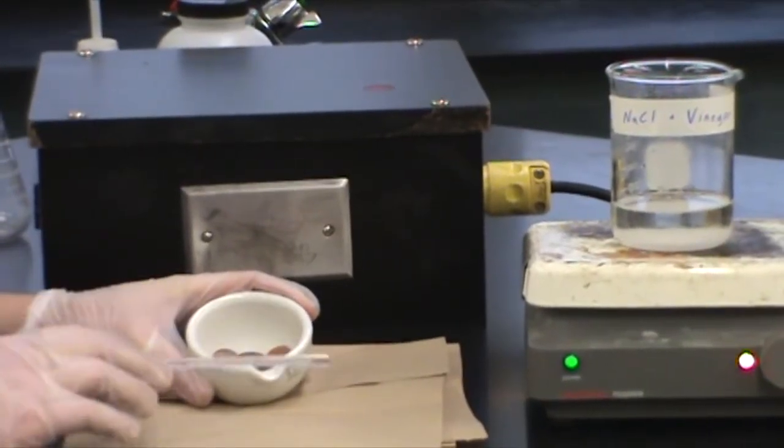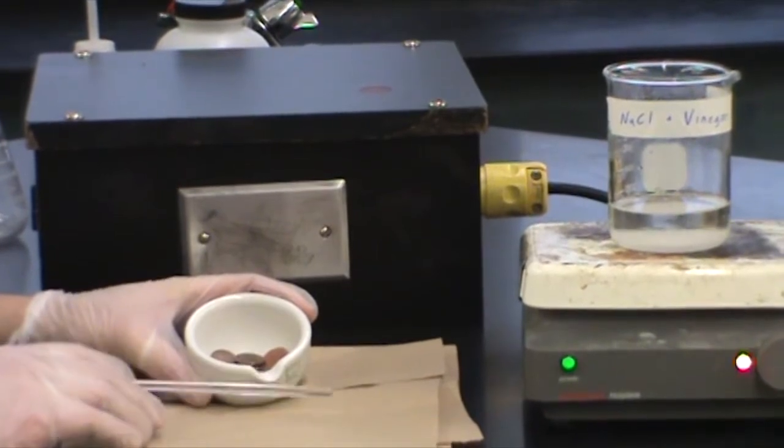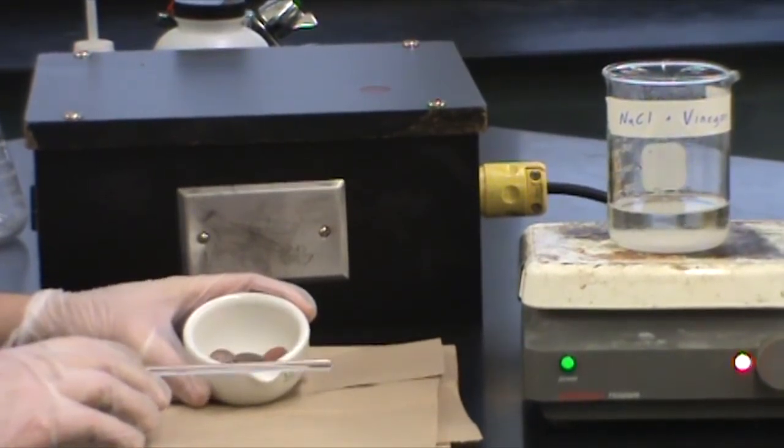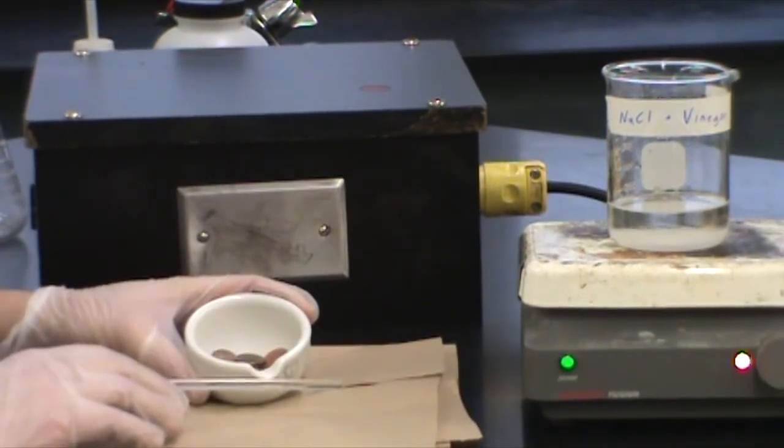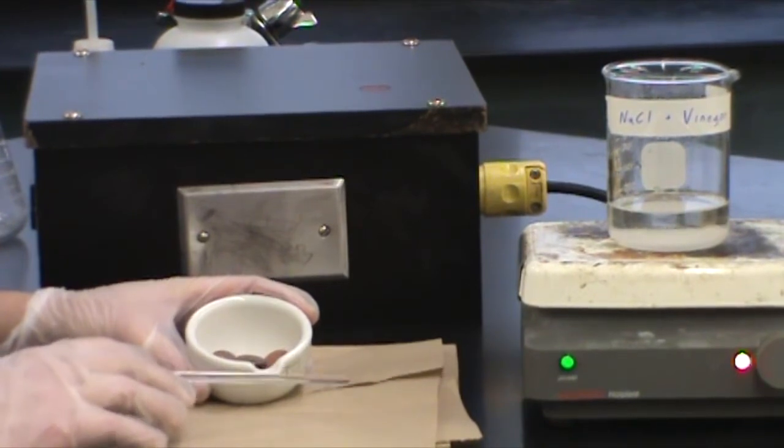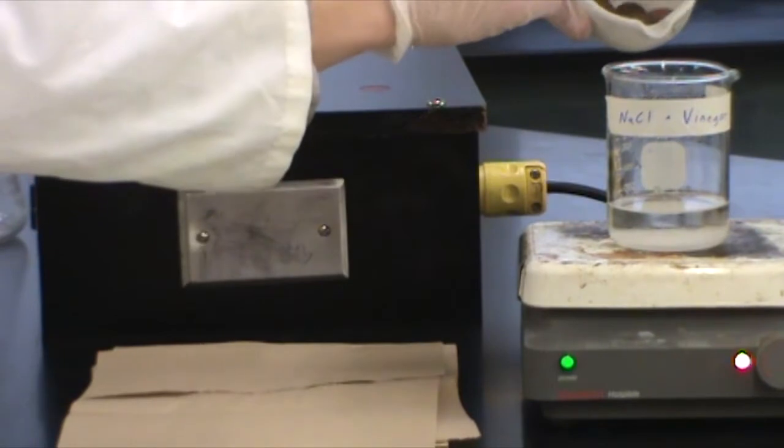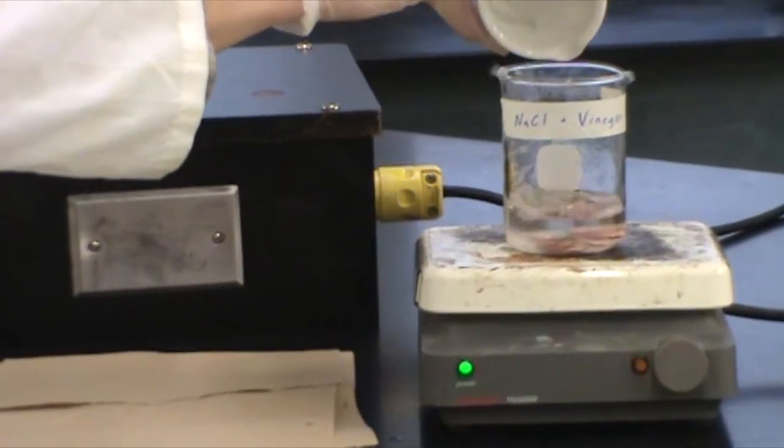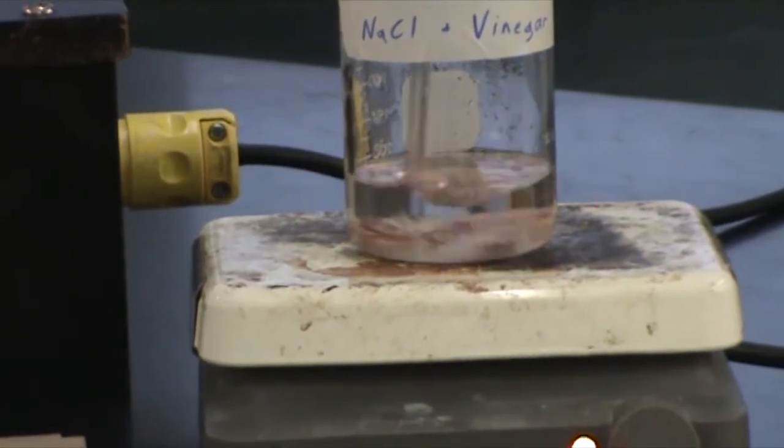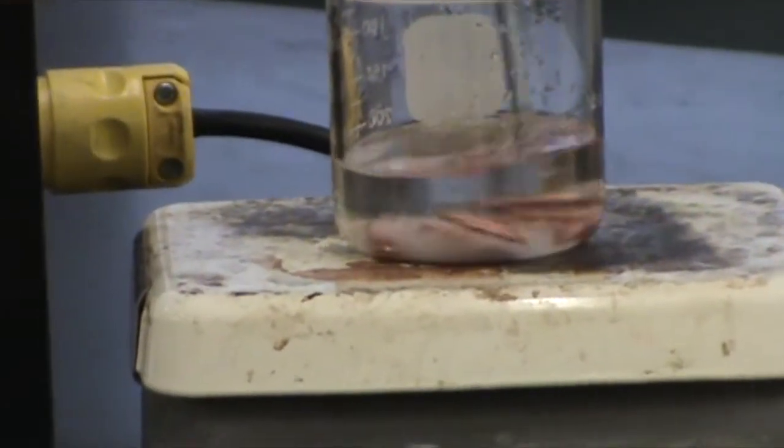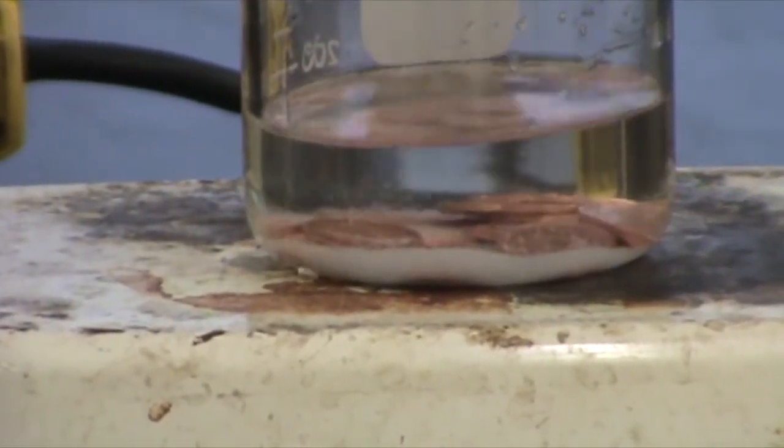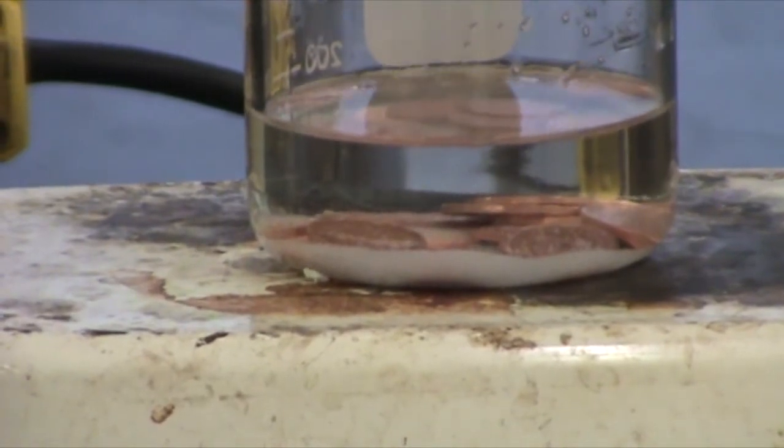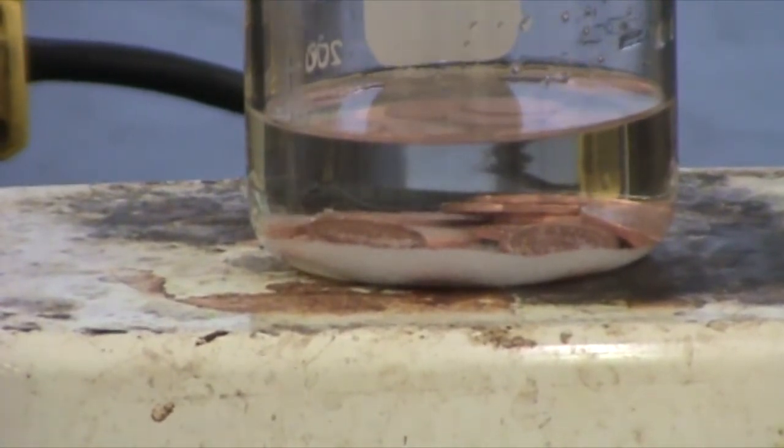The first step is to clean the copper pennies. Naturally the copper of the penny reacts with oxygen in the air to produce a dark greenish copper oxide coat that coats the penny. We'll dissolve this coating by bathing the pennies in a hot salt and vinegar solution. As you can see, the pennies are starting to shine. That coating has gone right off and it'll leave just the copper coating on the pennies.